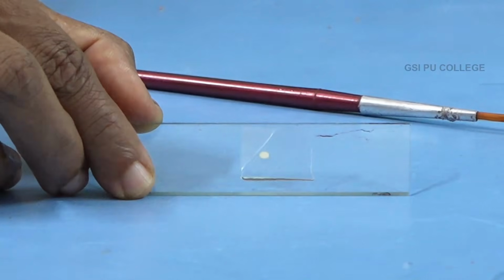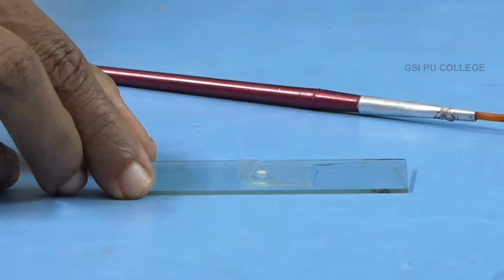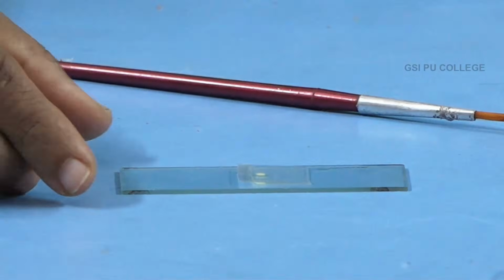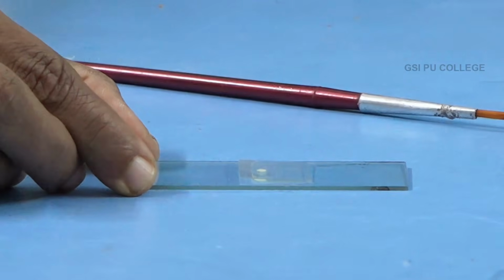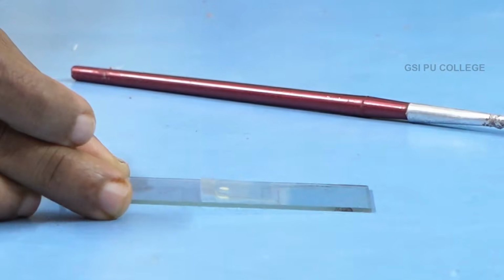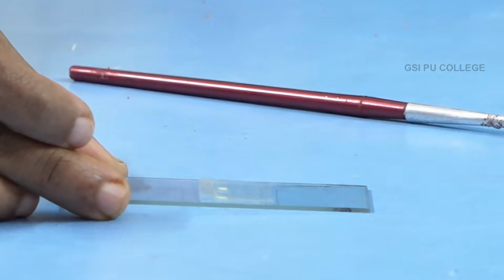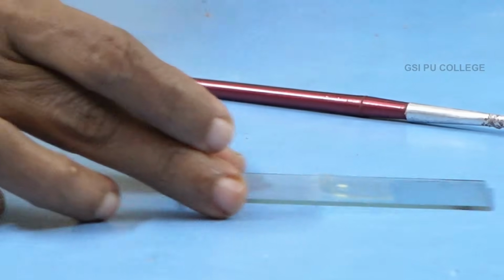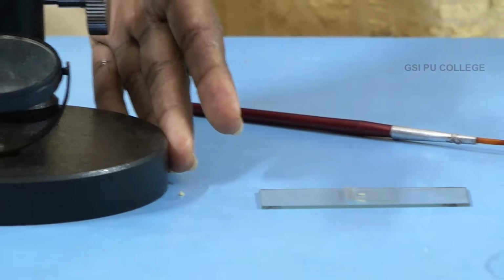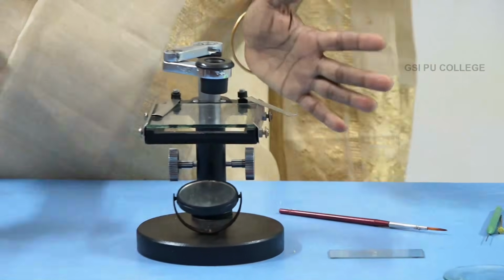So, you take the ovary, take a transverse section with the help of a blade, put it on a glass slide with 1 or 2 drops of water, cover this with a cover glass, and then focus using a dissection microscope.